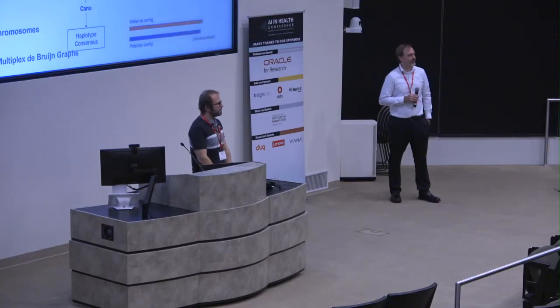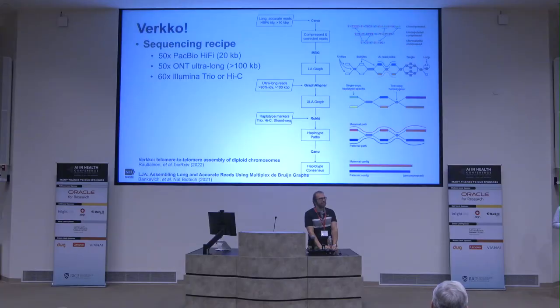Okay, thank you. It's the same question. When we are doing correction, it skips some motifs. Does that also cause losing some information? The main motif we skip in correction is the microsatellite. So no, because we compress it afterwards, because it's just too hard to correct those because alignments are very noisy there. But yes, I think we could do better correction.